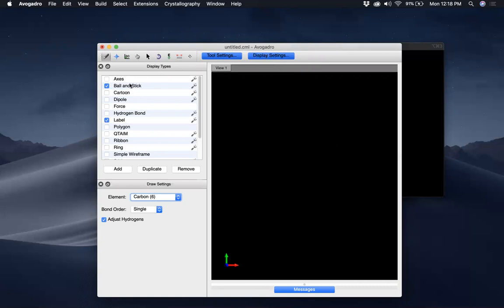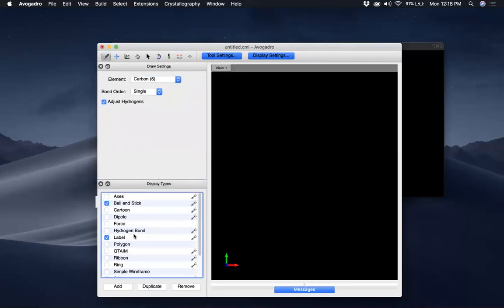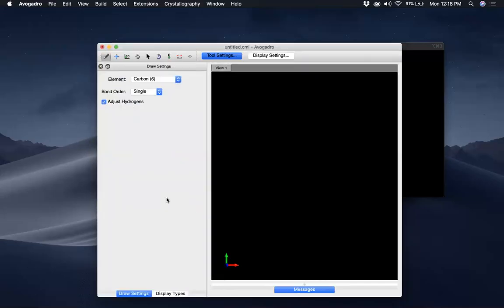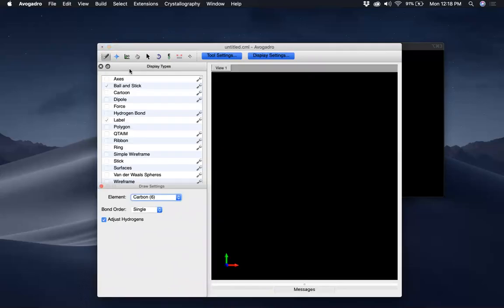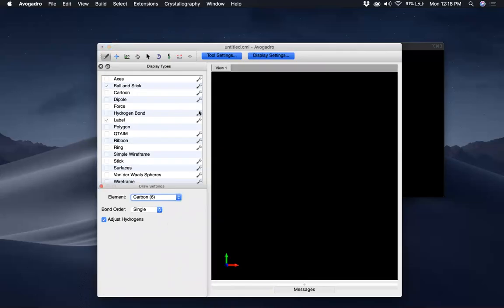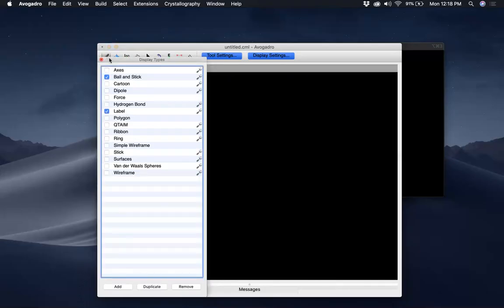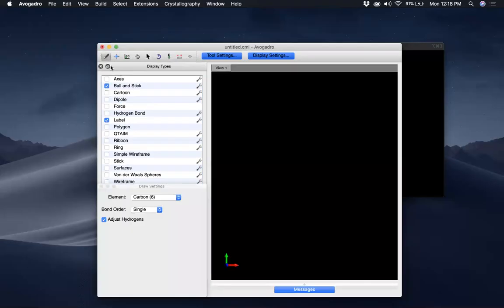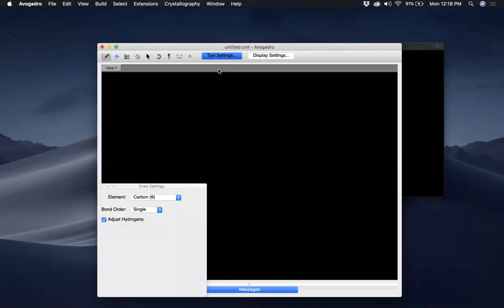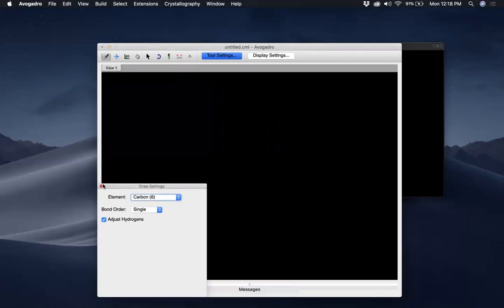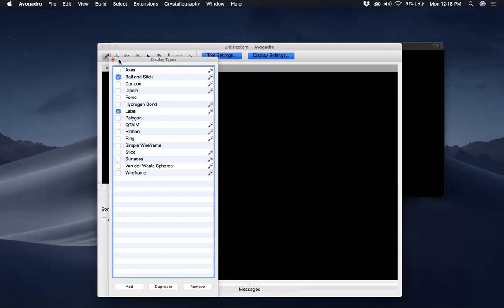I usually keep the Tool Settings selected and also keep the Display Settings selected. Once you select this, the Display Settings panel goes on top. You can move these two panels around, but I like to keep them in this order. You can click to detach them, or click back to bring them together.